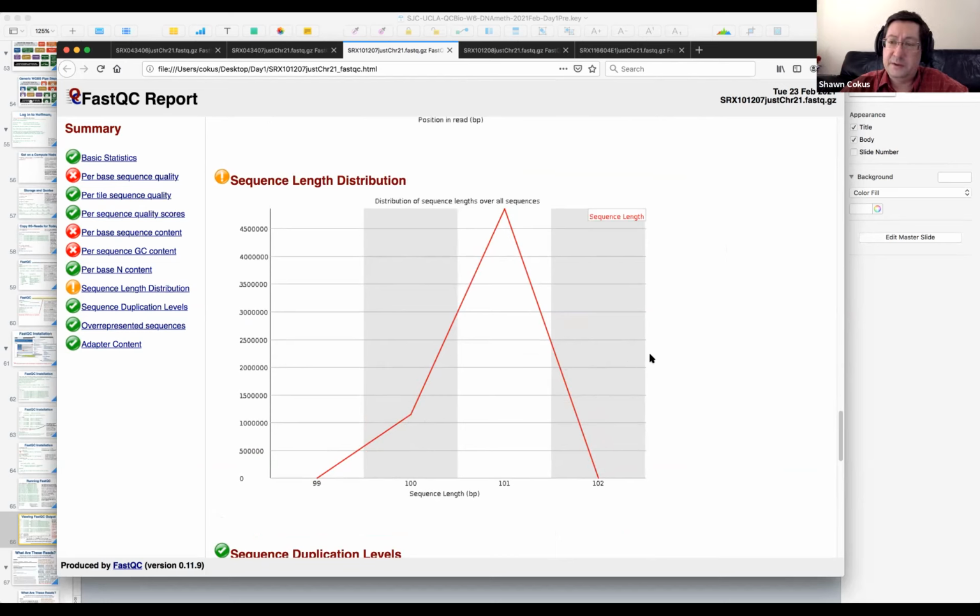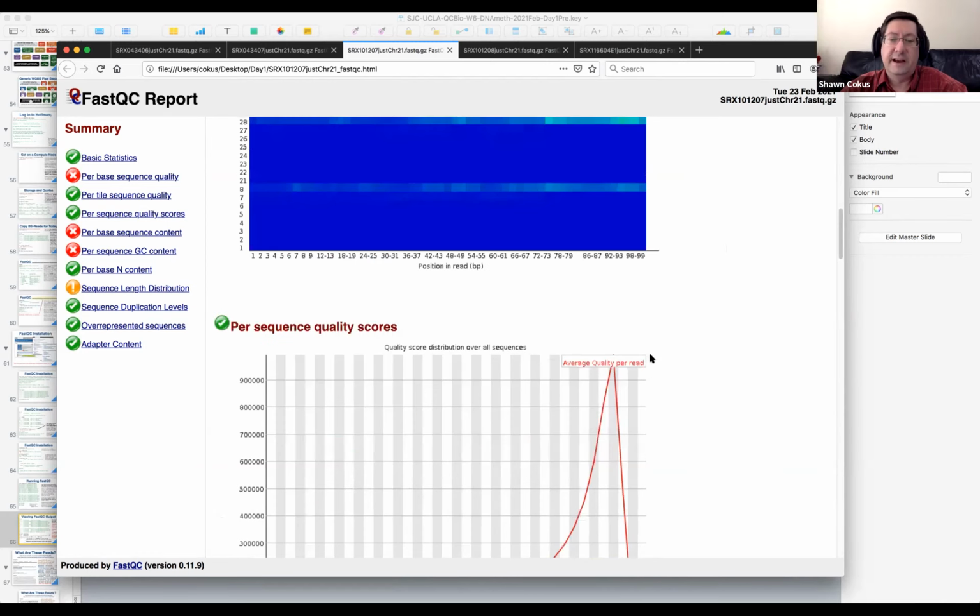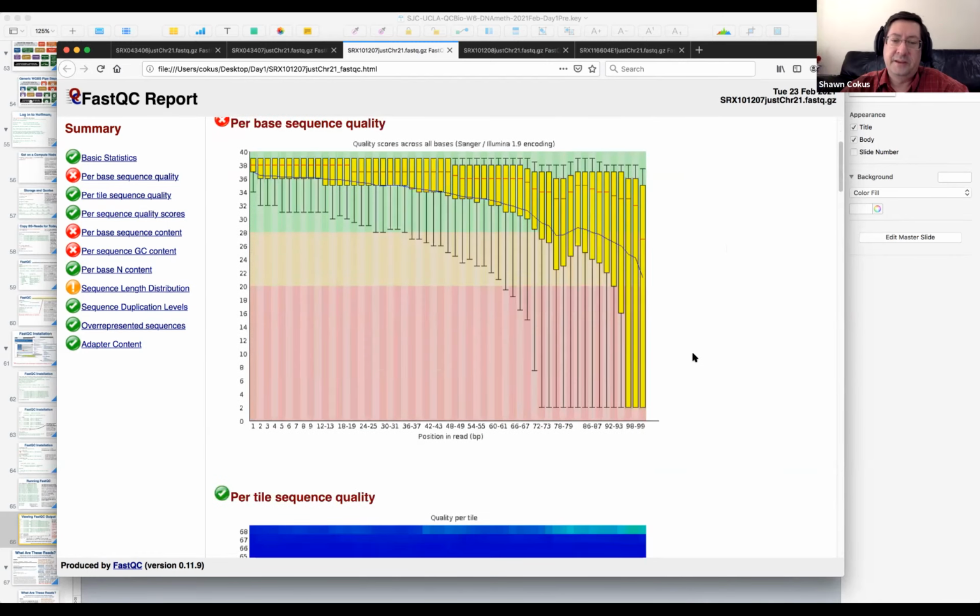It could also be that it was a mix of runs. Most of these, as I said, are a mix of like 7 or 8 runs. Maybe some of the runs were done as single 100, some of the runs were done as single 101. That's actually probably the most likely explanation. Anyway, but basically these are 100 runs. Okay, what do we got?